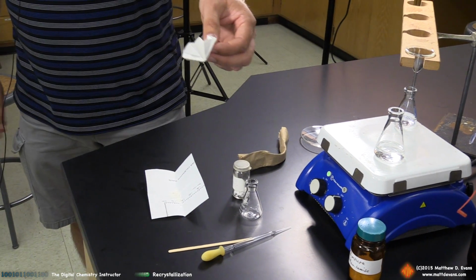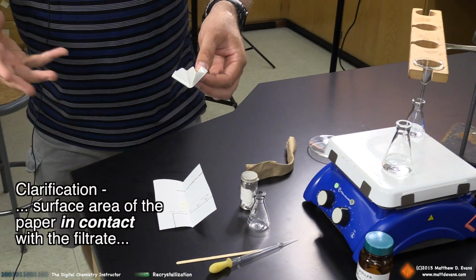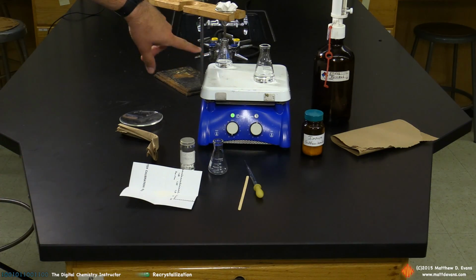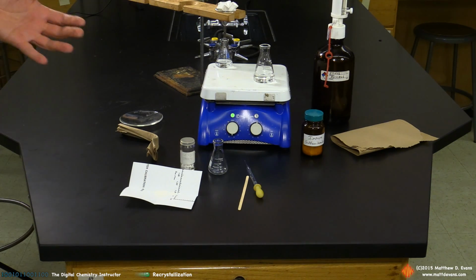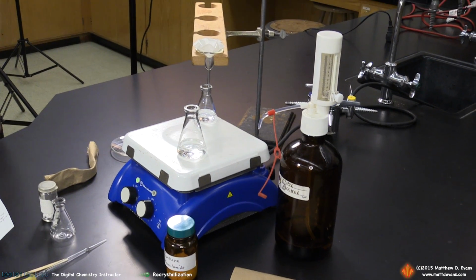The reason why we do this is it increases the surface area of the paper, and that makes the flow of the solvent through the filter paper much quicker. That just gets tucked in there. Normally, before I do a hot filtration, I've got this already ready to go, but I take some of the hot solvent and wet that entirely. If you don't have this entirely wetted, what happens is you dump your solution onto this and it starts crystallizing in the paper, and that's generally a bad thing. So you want hot solvent on here, hot solvent down here, just to prevent crystallization.